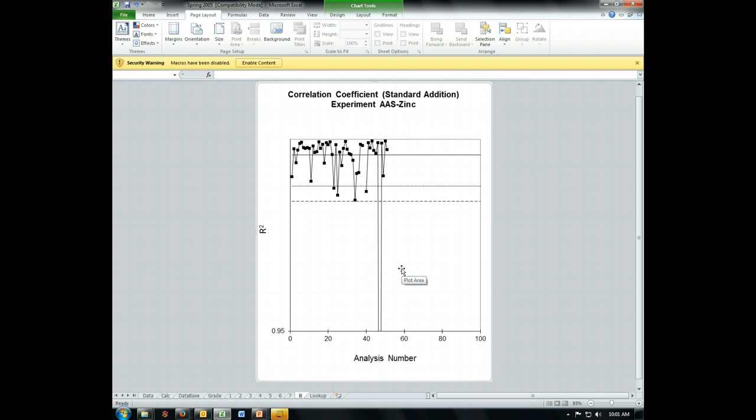And then our very last one is looking at the R squared for our standard addition experiment, and you see that, yep, once again, that person, gigantically bad R squared. And actually theirs is not all that bad, but compared to the others, it's pretty weak. Oh yeah, there it is, 0.83. That is actually very bad. 83% of the behavior is attributable to a straight line. The rest of this is up here, much more like 0.98, 0.98, 0.98, but most of the clusters up here in the 0.99s. See, 0.9964, 0.9971, even 0.9995. Those are good quality R squareds.